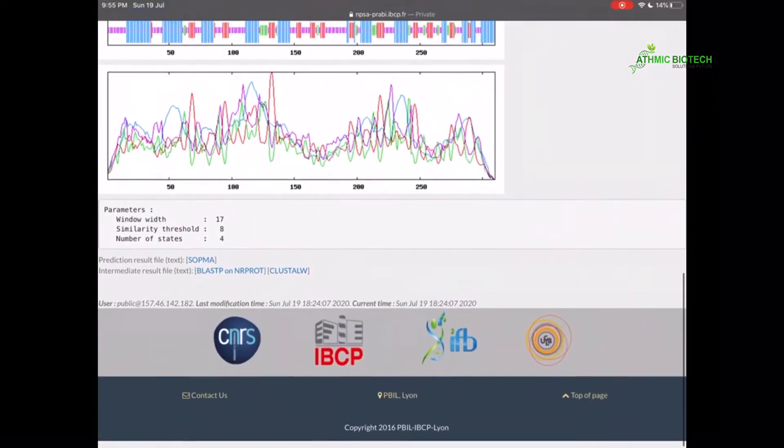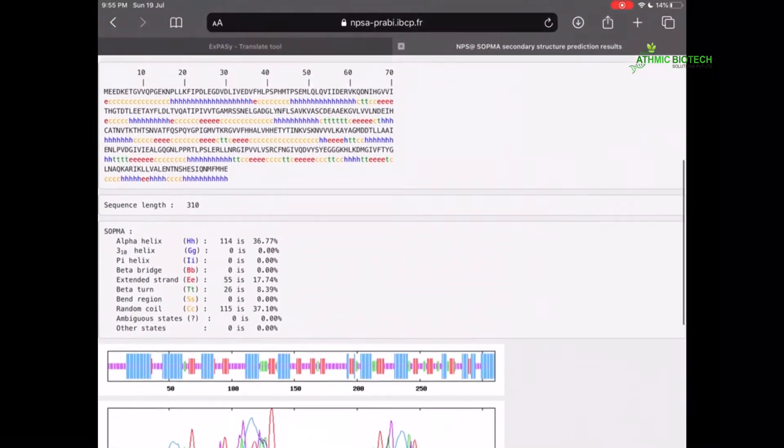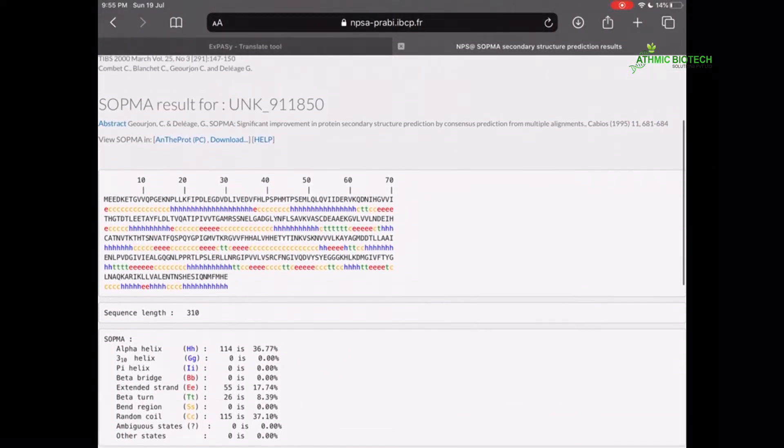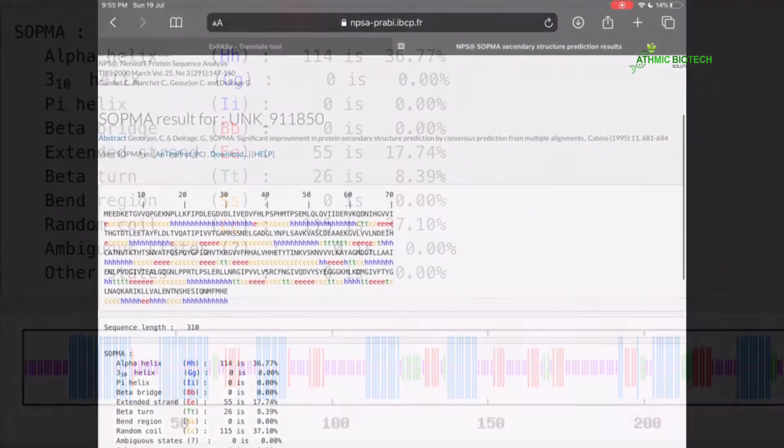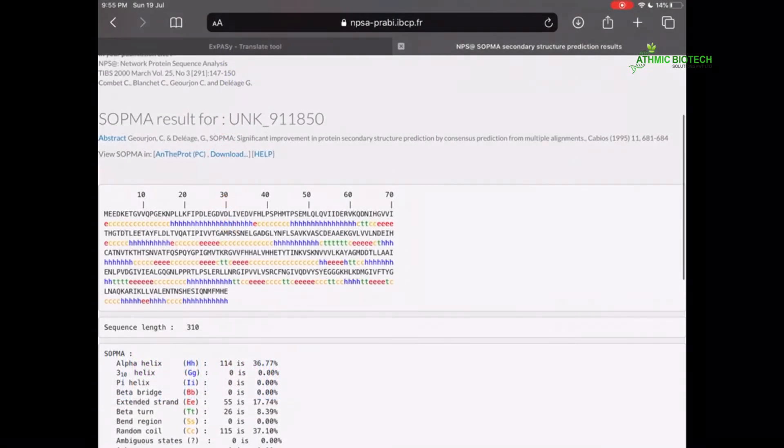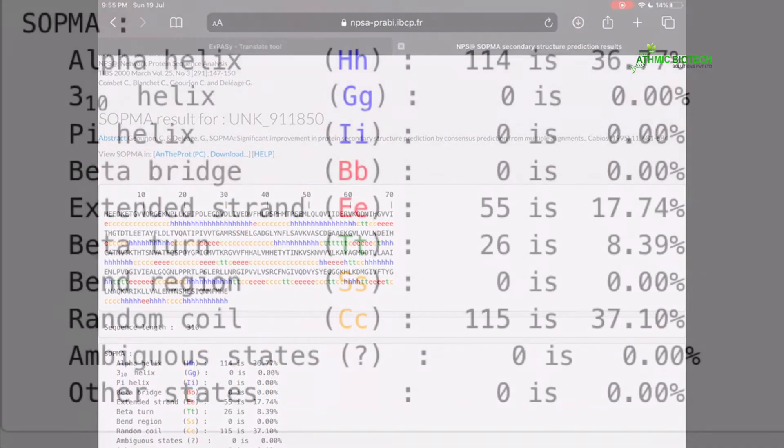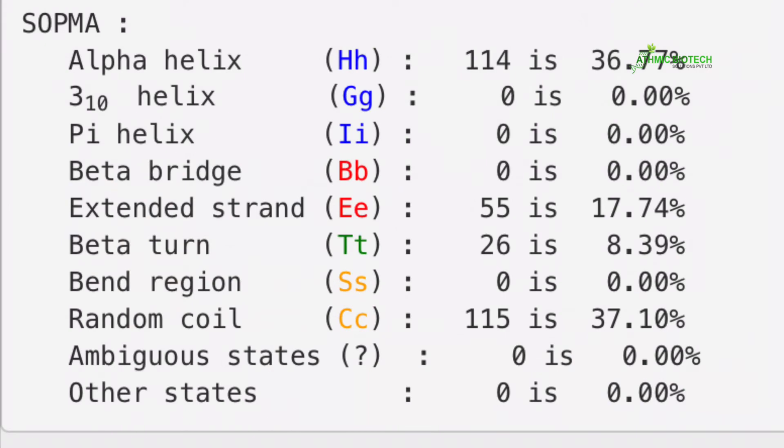Percentage-wise it is given in the box below. So you can see that 114 amino acids are contributing to the Alpha Helix structure, that is around 36.77% of the total amino acids. And 55 are contributing to extended strand, that is 17%. Likewise, you will get the statistical data of how much amino acid in this structure is contributing to various secondary structures.